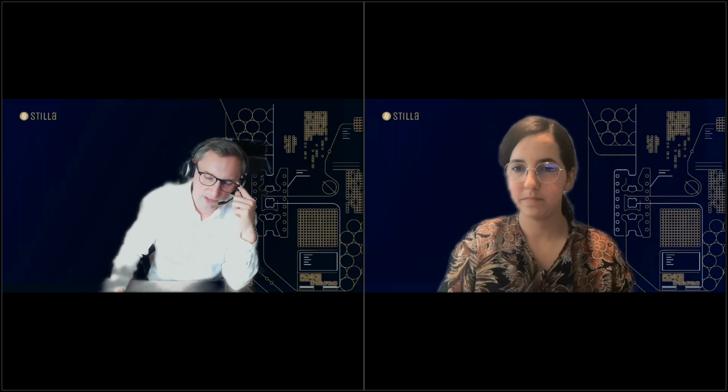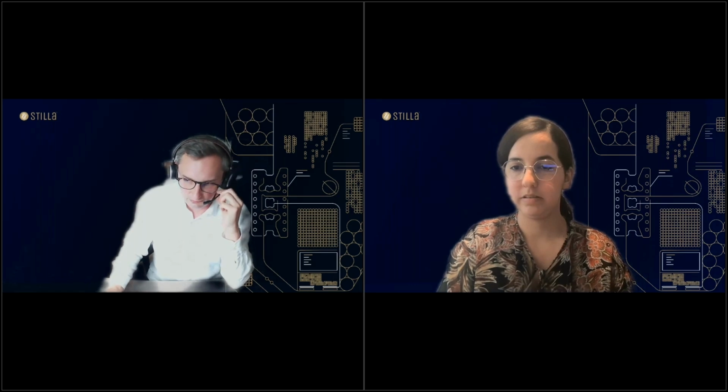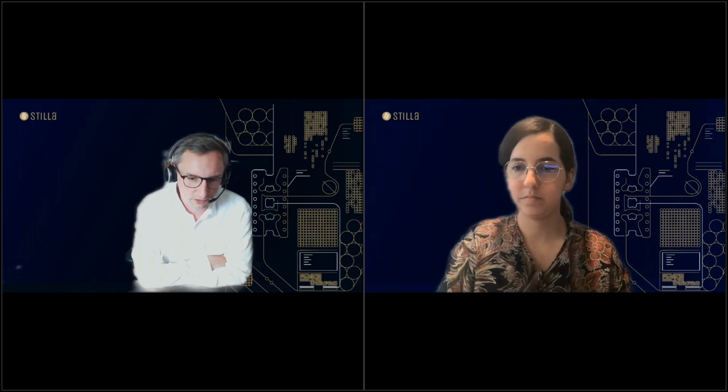Once you have a single measurement and you see that you are very reliably able to measure that amount, for example for higher concentrations of a transgene, it's not a big problem. It's always just a problem when you have low concentrations of a GMO. For a low concentration of a GMO, in one measurement it's negative, in the next measurement you have one positive, in the next you have two positives. But the same problem you would have in the qPCR.